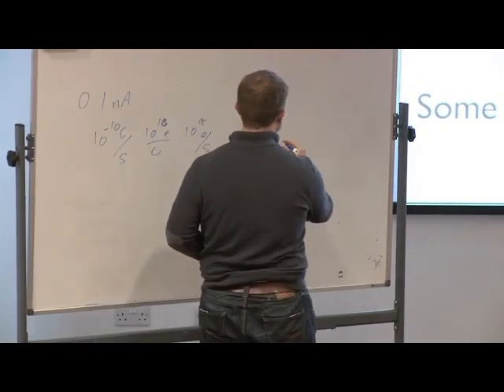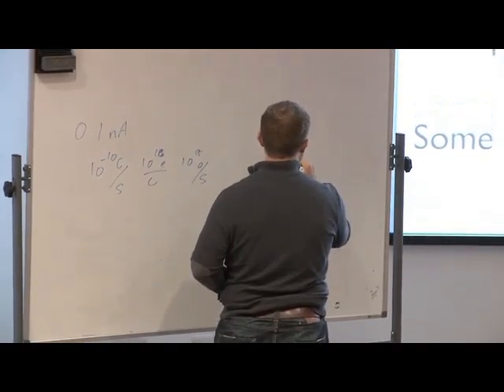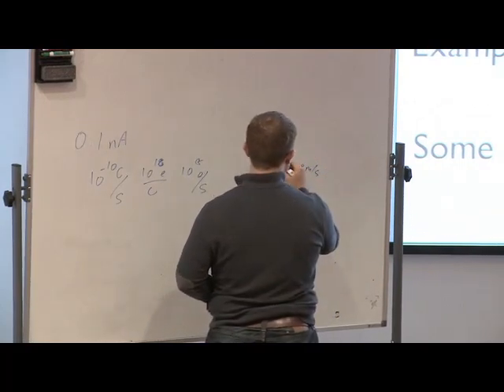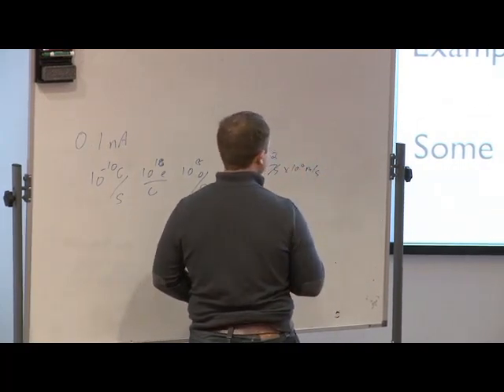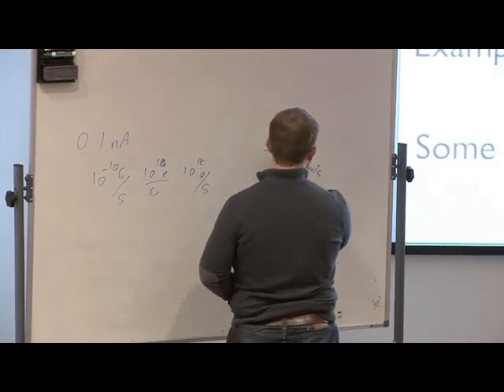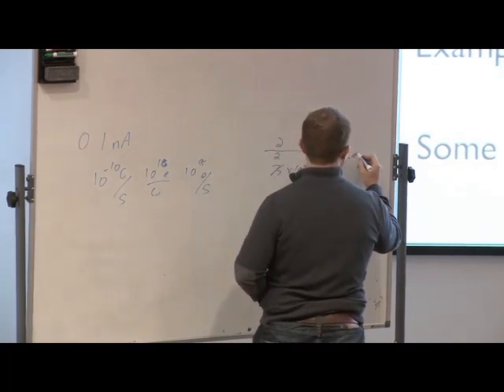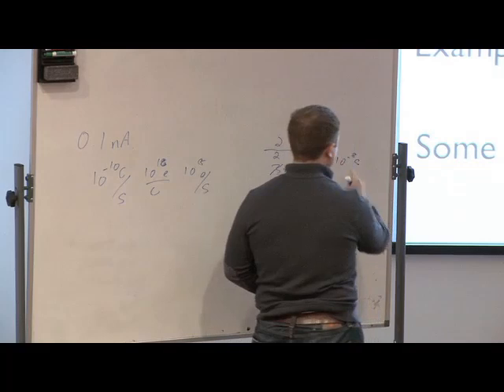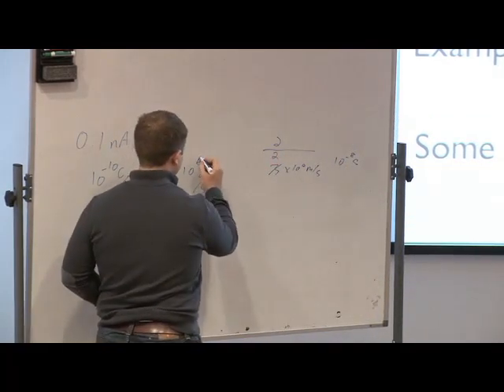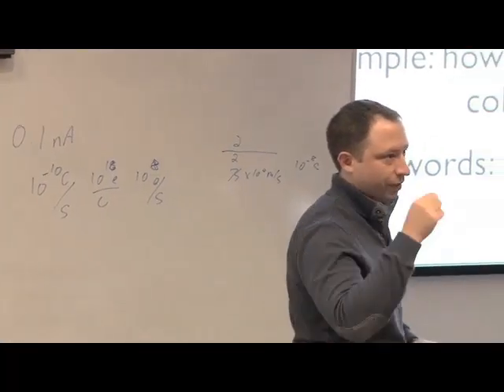So I just told you that it's moving at, let's say, 2/3 the speed of light. The speed of light is 3 times 10 to the 8 meters per second. So if we say it's 2/3, then that's 2 times 10 to the 8 meters per second. And a typical electron microscope, like the one Shausha was standing next to, is maybe 2 meters tall. So that's 10 to the minus 8 seconds for an electron to go from the top of the column to the bottom. So it doesn't take much to realize that 10 to the 8 per second and 10 to the minus 8 seconds means that there's only one electron in that column at a time, right?